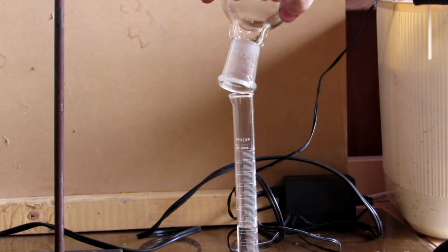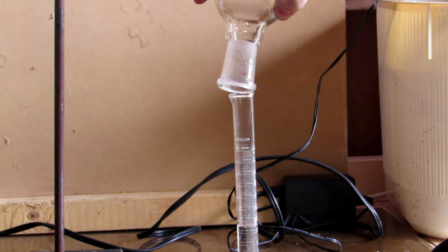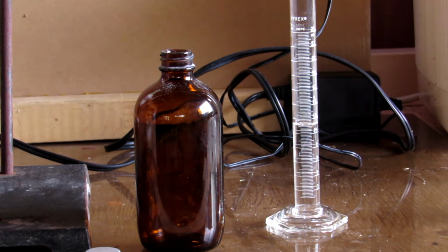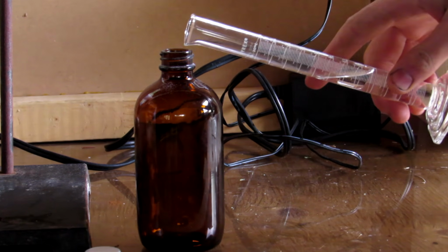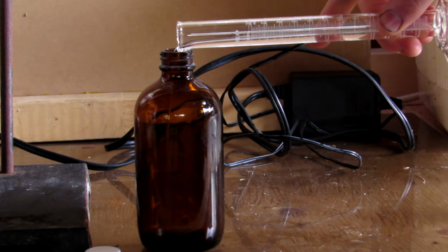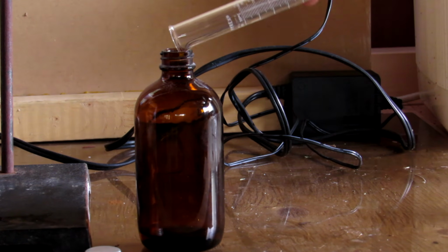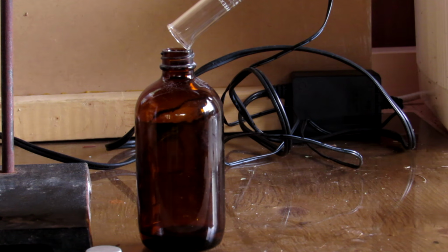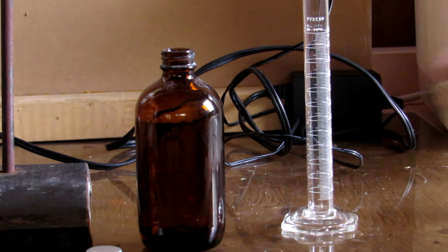The low yield is likely because ethanol was made to be the limiting reagent, so the purification would be easier. As mentioned earlier, Fischer esterifications work best when an excess of ethanol is used to drive the reaction forward. This method is definitely not the easiest or cheapest way to produce ethyl acetate, however it is fun and a good example of a Fischer esterification reaction.